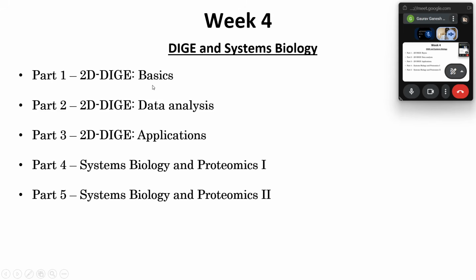Initially we'll be talking about what the DIGE technique is all about, how we perform that. Then after performing that specific DIGE analysis, how can we analyze the data after obtaining the results, and a few applications related to that, how DIGE can be utilized. It is similar to 2D, but depending upon your need, you can use the DIGE technique as well. And a bit of system biology, which is related to proteomics.